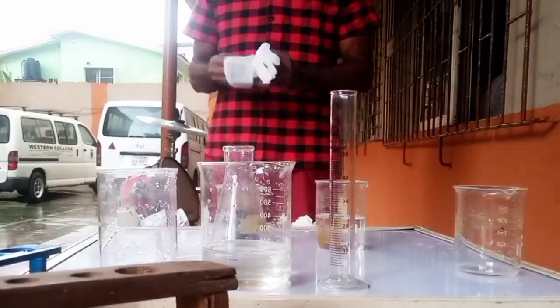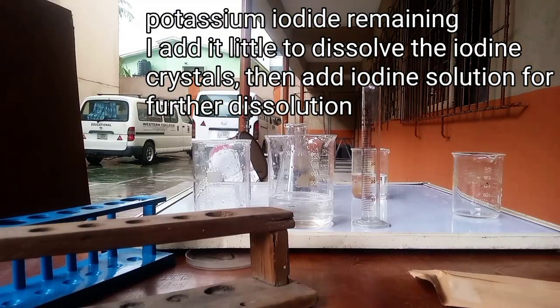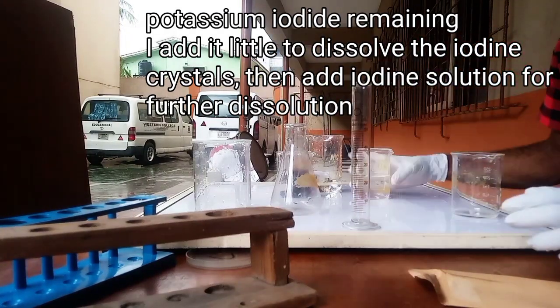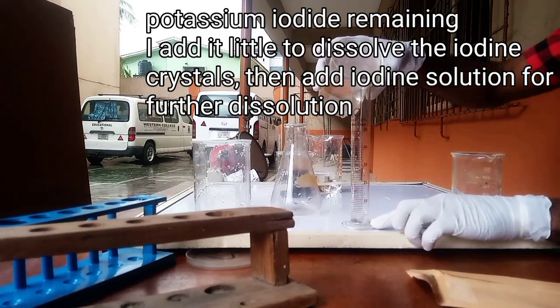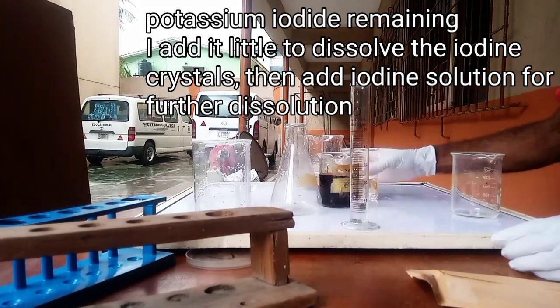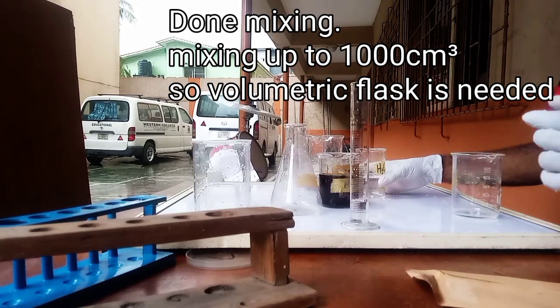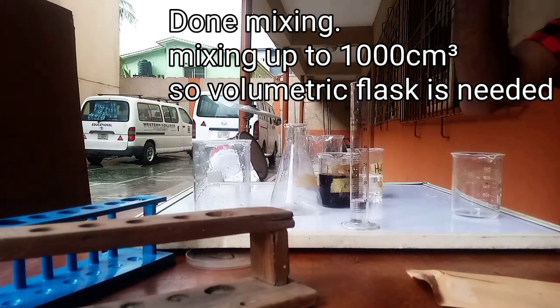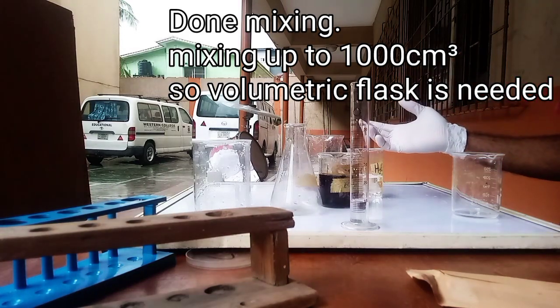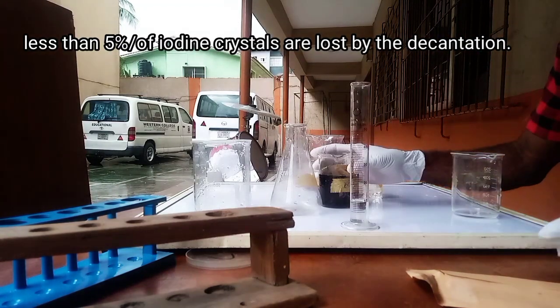Now, you know, they normally ask us to use 25 centimeter cube, then I normally use 10 centimeter cube to see how much of solution A will be required for this, and that is why I brought in this measuring cylinder. I shake my solution A very well, and I also make sure that it is well mixed. But I'm going to first of all add 10 centimeter cube of the solution B, which is this colorless sodium thiosulfate. That is the solution B. I'm going to add it in there.